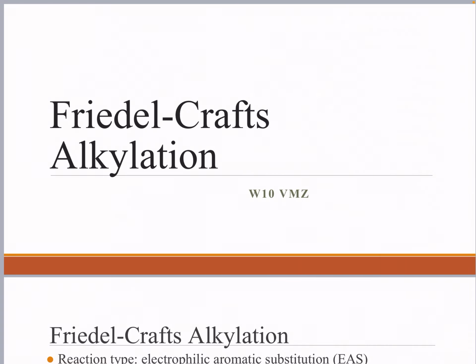Hey guys, we're gonna go through a brief introduction on Friedel alkylation reaction, which is gonna be the experiment next week we're about to do. It's gonna be a multi-outcome experiment. It's also the second experiment this semester that does not have a candidate bank to choose from. Again, this time you're gonna be using your spectral analysis skills and glean all the information you can get to identify the unknown alcohol. Okay.